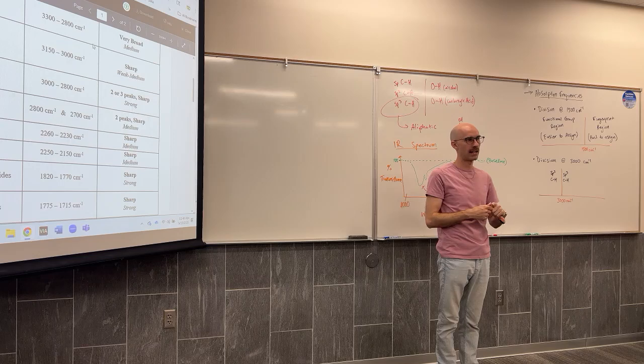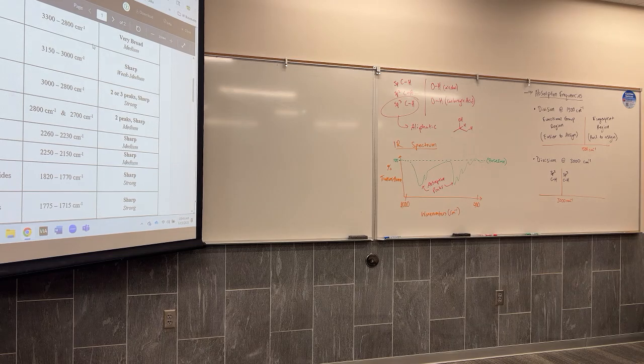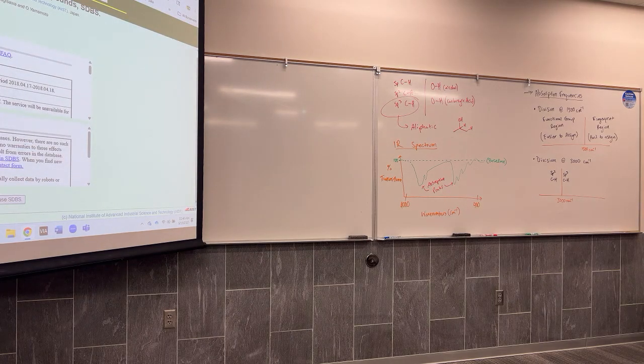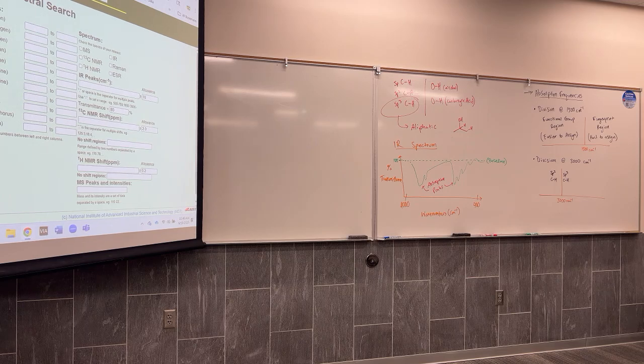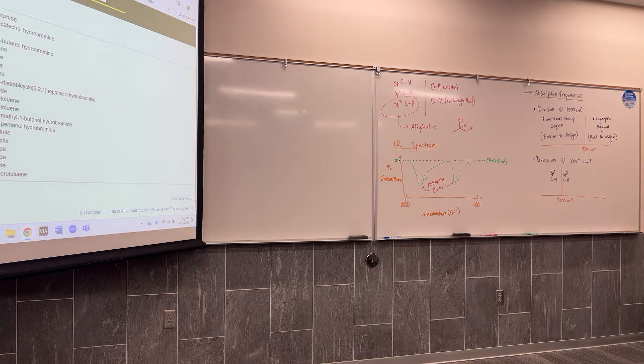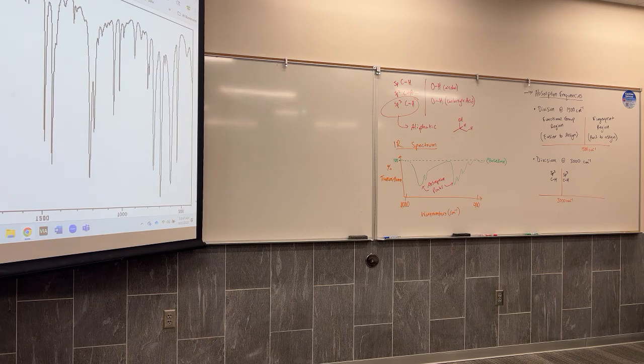Active is not as nice. Active does not necessarily give you those lines. Also, I am only giving you guys experimental data. Active gives you cleaned up data. So when I give you data, it's from SDBS, and SDBS is uploaded experimental data. I don't know where Active sources their spectra from, but their spectra are a little bit cleaner.